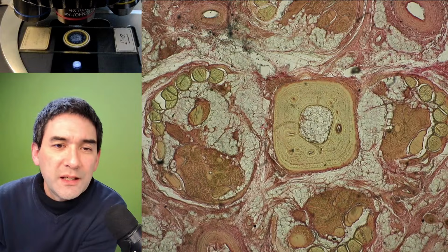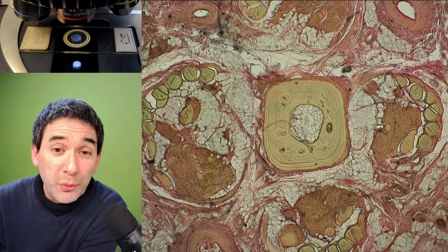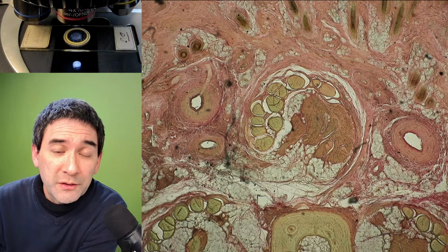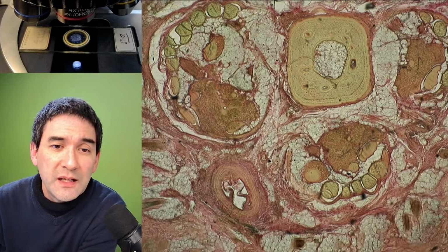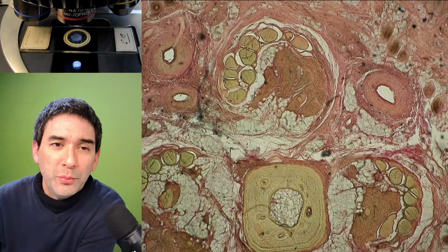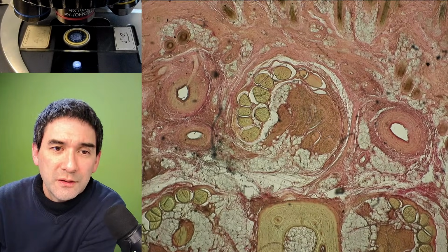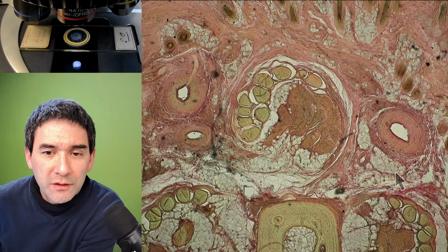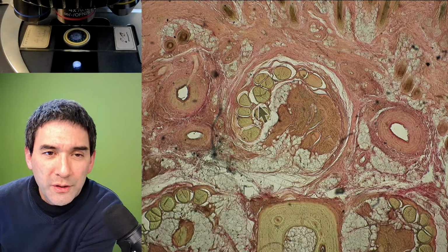What we've got here in the center, for example, that's the cross section of the bone. You've got here on the top, I always move it down to the center, these are muscles and tendons for moving the tail. Maybe I will show it to you with the arrow over here. That's one set of muscles, and these things here are tendons that connect the muscle to the bone.